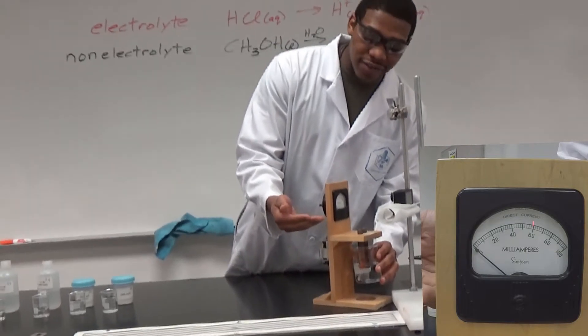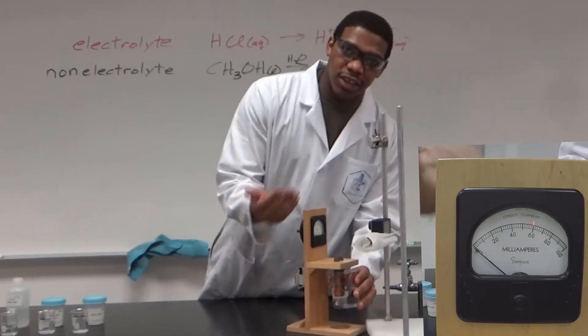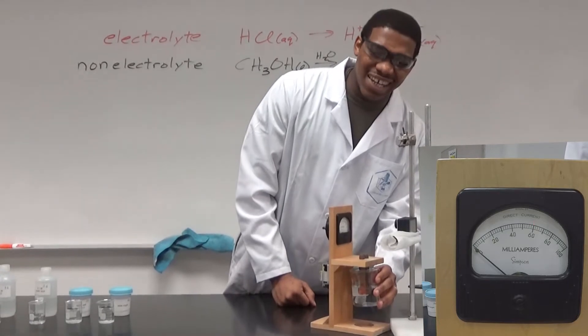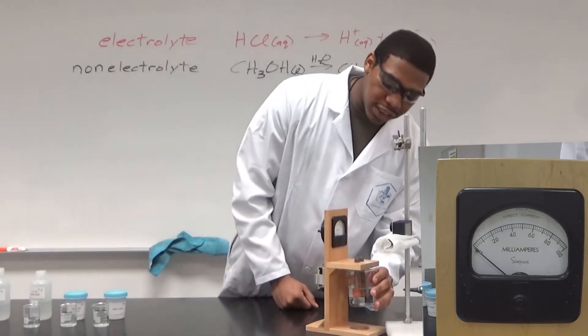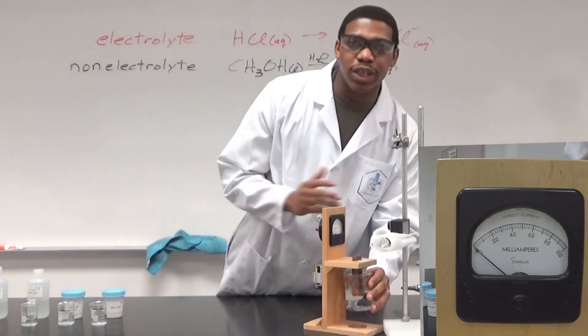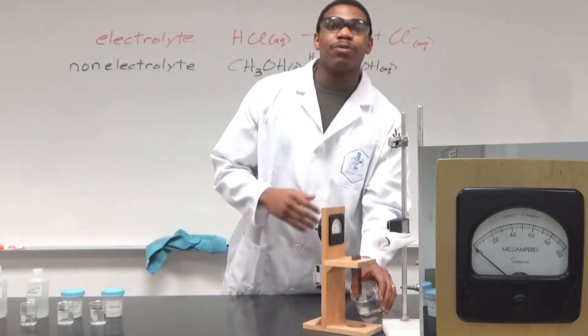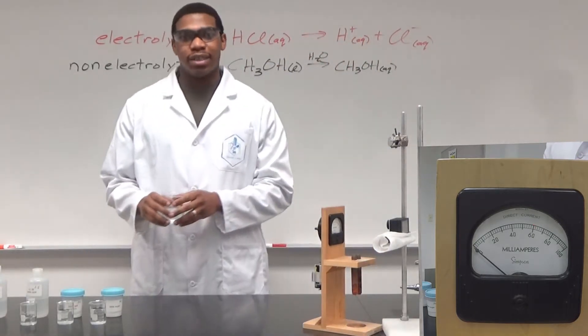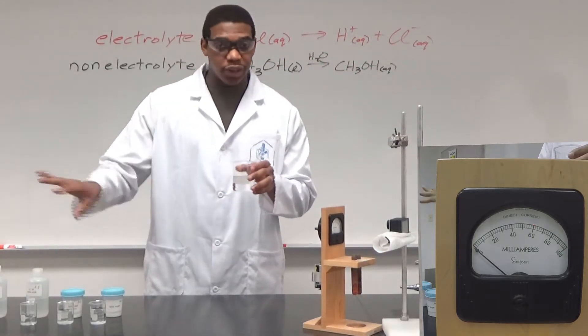On the left side, if that arrow starts to spike up, then you know the solution is conductive. As we see here with the DI water, there's really no movement in that meter, so we know it's not a conductive solution, which makes sense. There's really no ions present in DI water.